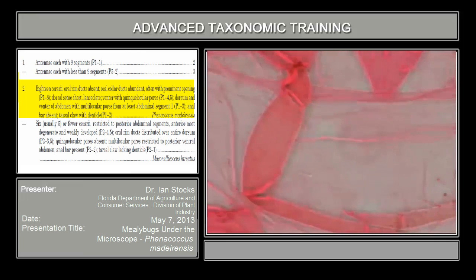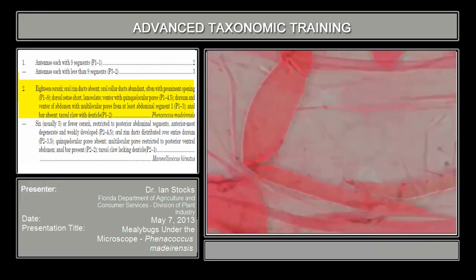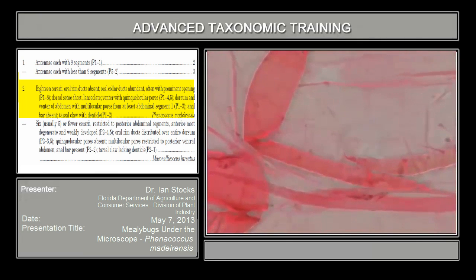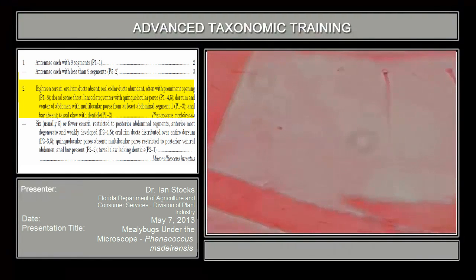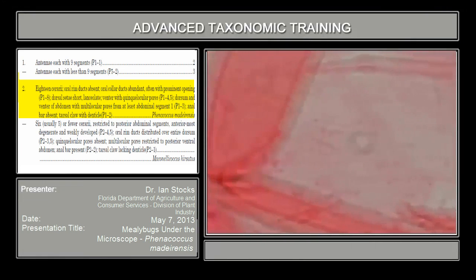So what I want to do is go up on the mealybug to around below the mouth parts, kind of in the middle a little bit, and then go up to 200x. And what I want to look for is the setal sockets for the cerarii. Now, cerarii do not have to be restricted to the margin in the form of a cerarius.